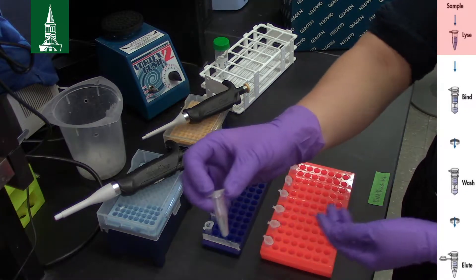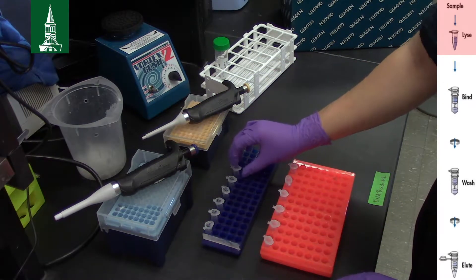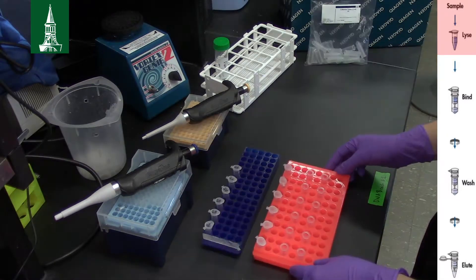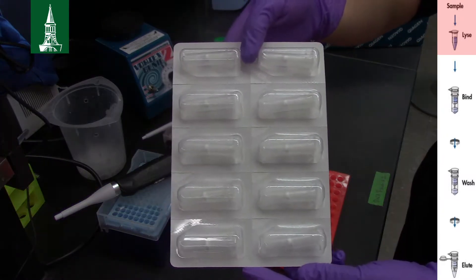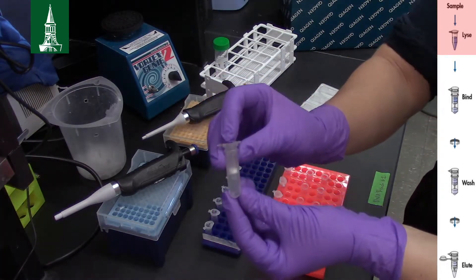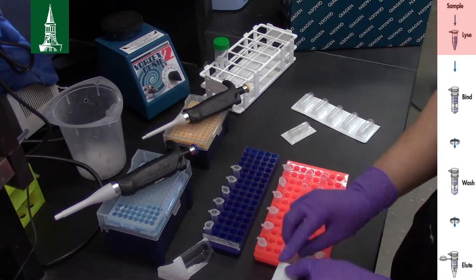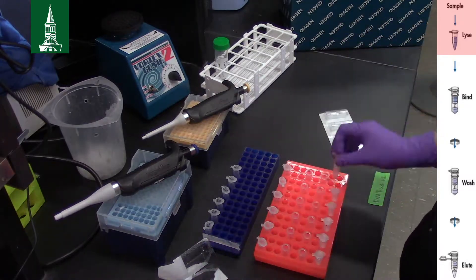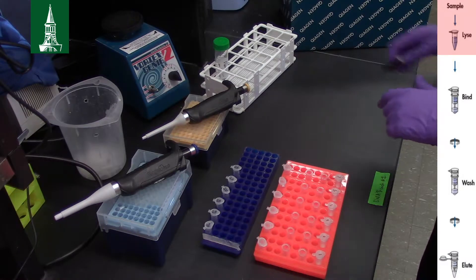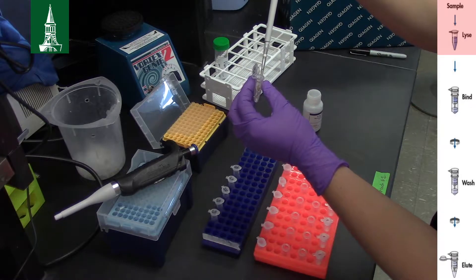Prepare 25 mg of tissue in 1.5 ml microcentrifuge tubes. Prepare 2 ml collection tubes and DNeasy mini spin columns placed in 2 ml collection tubes for later use. Make sure to always label your tubes. Add 180 µl of buffer ATL to your tissue.